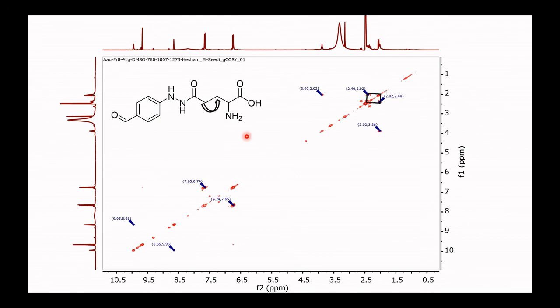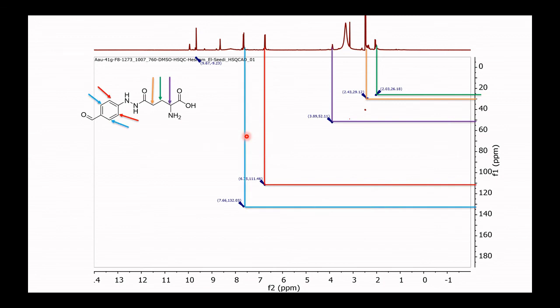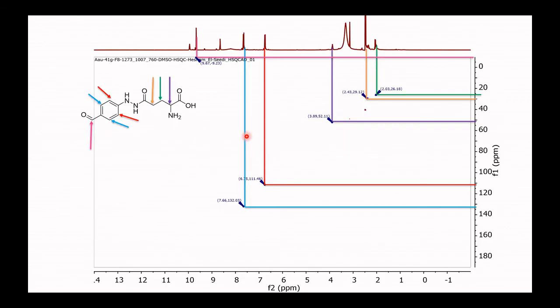Now you can see these two protons, you find the square. Second, a square. Again, these two protons, alpha, beta saturated ketone, and finally, these two protons together, right? You go to this spectra as well, then you can see the assignment of the first proton, second, etc., the aromatic protons. But at the end, I can ask you a question.